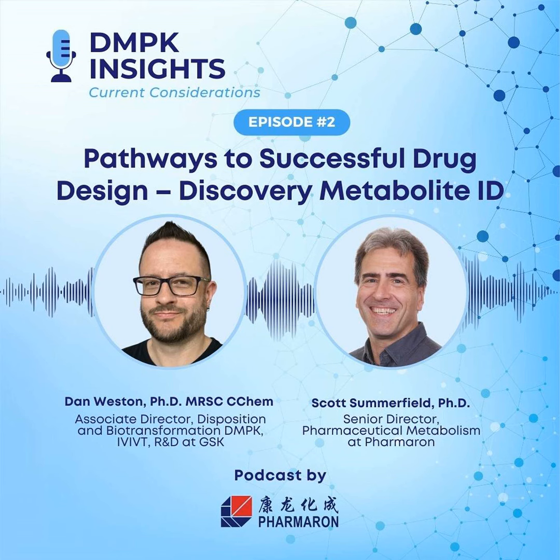Absolutely, and I think that's touched on in the paper, but it's really something that we do by default. Rather than just doing Met ID, we provide the biotransformation part, so this is what's really relevant out of what we see, and how do we contextualize that to what the project has asked, based on the structural moiety or that series.